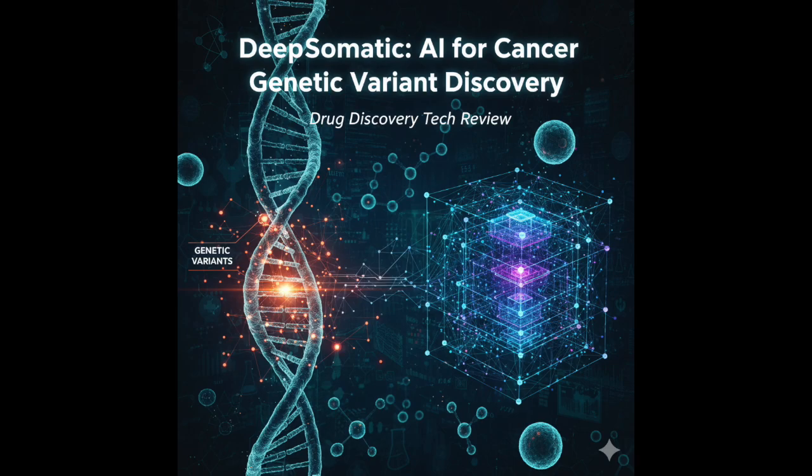Instead of just giving a variant and a quality score, DeepSomatic uses specific filter tags defined in the VCF header to tell you what the model decided. Let's look at the example from the documentation. If I see a line of the VCF and the filter column says PASS, what does that signify? PASS means the model is confident that this is a true somatic variant. All internal quality checks and classification criteria were met. This is the signal you're usually most interested in for cancer research or treatment decisions.